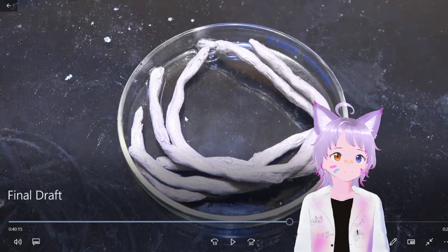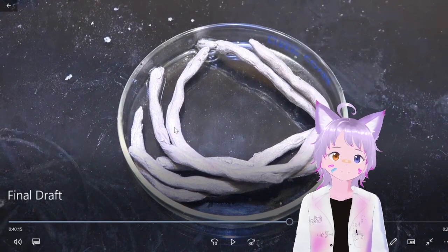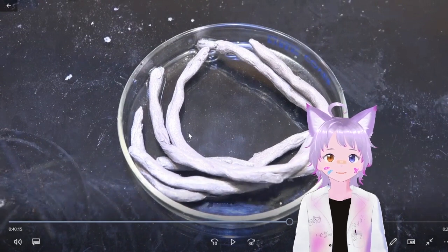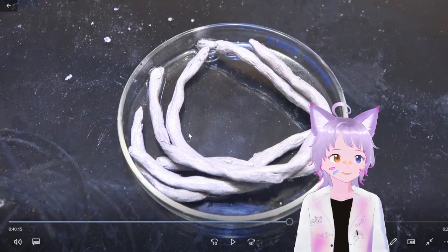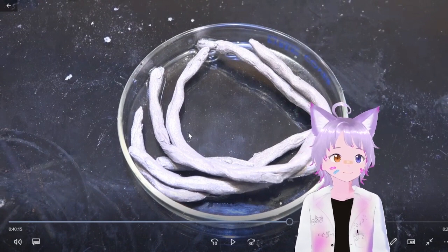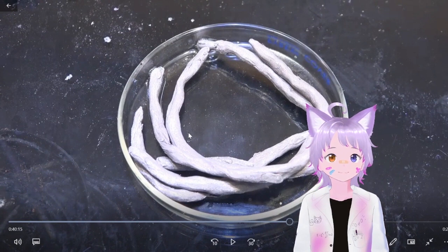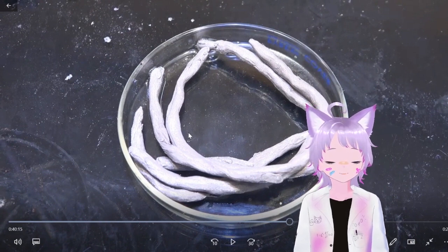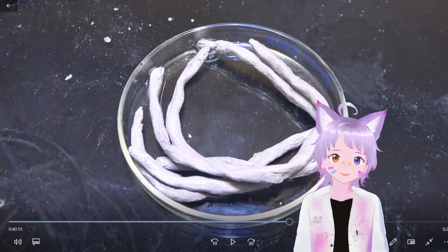I actually don't know how he did this. That's not hard. It's easily rollable. He probably just rolled it on a table, honestly. That's how I would do it. Like Play-Doh? Yeah, sodium is really, really malleable. You could literally treat it like Play-Doh and it would work. Maybe a little harder force, but it would do this. Very explosive.